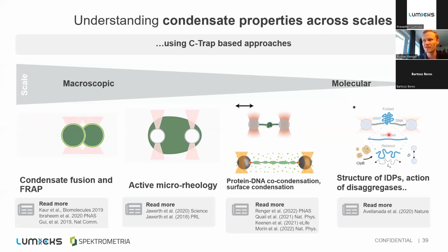And if you want to go even into a smaller structural level of detail, you can study individual proteins. You can have 2 optically trapped beads and a protein of interest in between, connected with 2 DNA tethers. And then you can directly pull this one protein. As you've seen in this chromatin example, while you try to unfold this protein, you can infer structural details of these proteins. And for example, you can compare different phosphorylation states of a protein and see if one that is associated with aggregation of proteins has a different internal structure than one that is less aggregation prone.